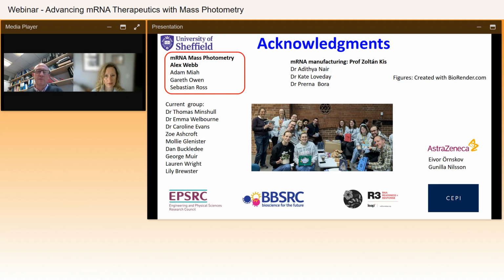As I said before, there are some caveats that we've developed and worked around. Most traditional commercial ladders are equi-mass, which gives you a bit low intensity of the larger molecular weight or larger size fragments. So we now have generated an in-house RNA standard where the fragments are equimolar and cover a bigger mass range. Each of those RNA standards also has a poly A tail, so it's very similar to the RNA that we're analyzing. So it's essentially just using a calibrant and a calibration curve.